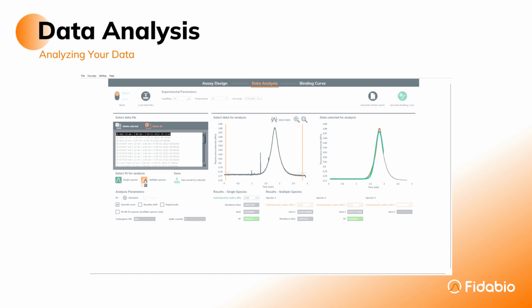In this case, there are 2 species, so we will use this fit. You can save the result by clicking the relevant button. This procedure is then applied to all data points.